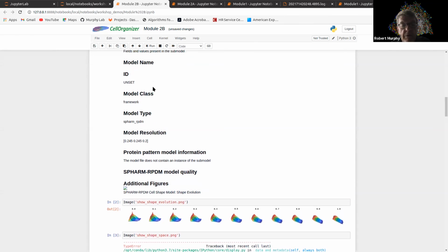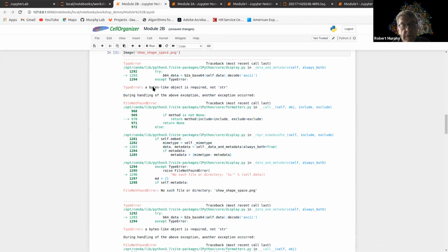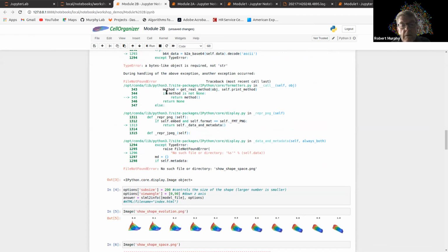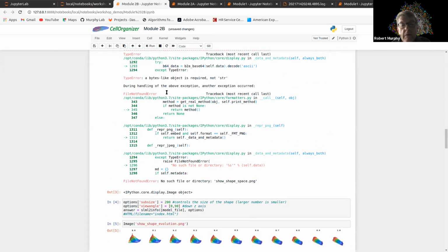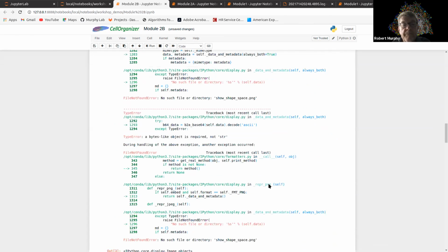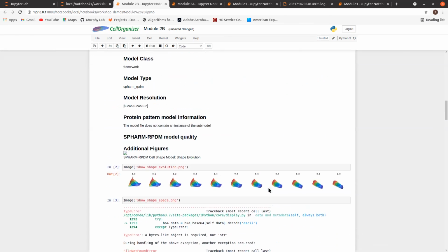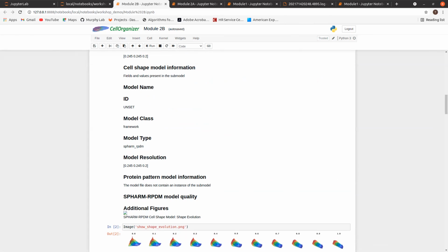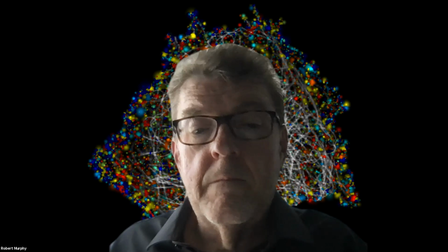If we scroll up, what's happening here? That did not happen previously. Hmm. Do you need to maybe clear the directory and run it again? Do you want to share yours quickly? Let me see what the issue is. I will run mine, and in the meantime, let me see.